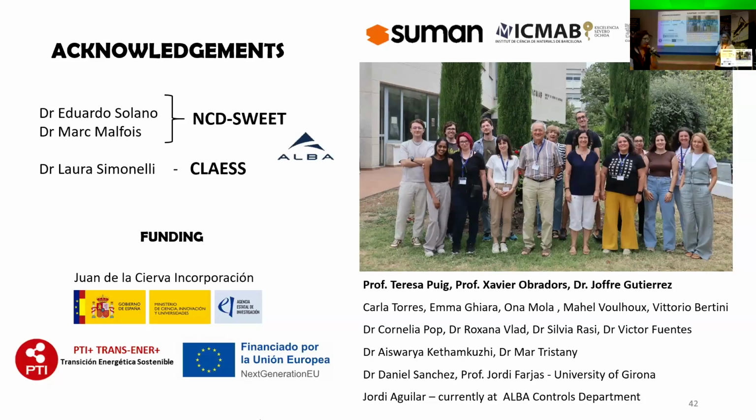With XRD here already, with a few nanometers, you have already signals. So in synchrotron, we are assuming that the first layers, already 5-10 nanometers, we should see. Now our samples are about 400 nanometers as standard, and that means that we can really see the full growth. Of course, what we probably cannot see is what we are trying to do with the GISAXS, which is the islands. But as soon as we have a layer, which probably is about 5-10 nanometers, we are already able to see it.